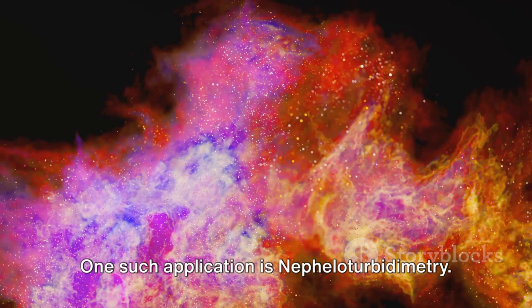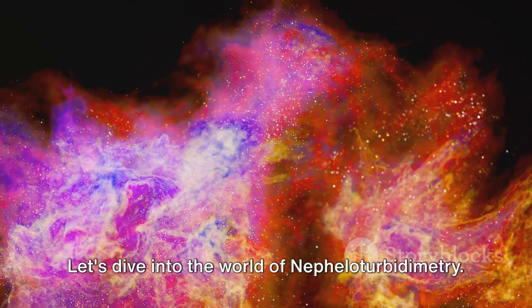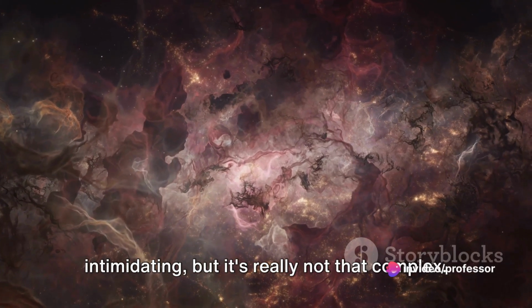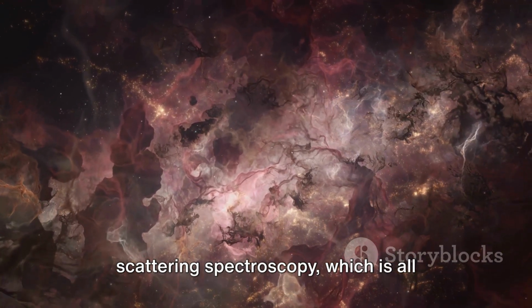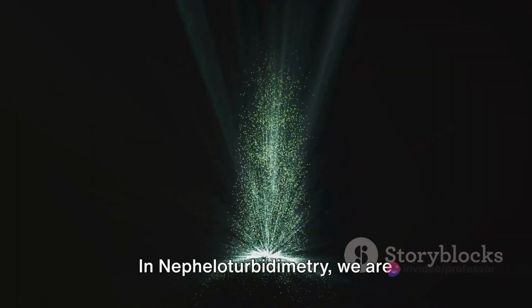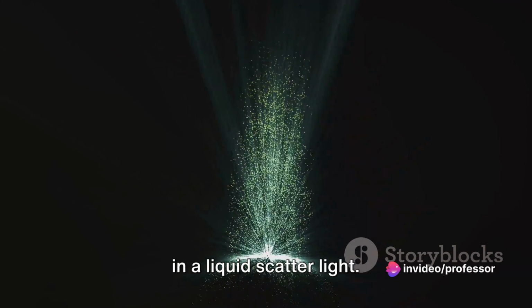One such application is Nepheloturbidimetry. Let's dive into the world of Nepheloturbidimetry. This fascinating term may sound a bit intimidating, but it's really not that complex. Nepheloturbidimetry is a sub-branch of scattering spectroscopy, which is all about studying how particles scatter light. In Nepheloturbidimetry, we are particularly interested in how particles in a liquid scatter light.